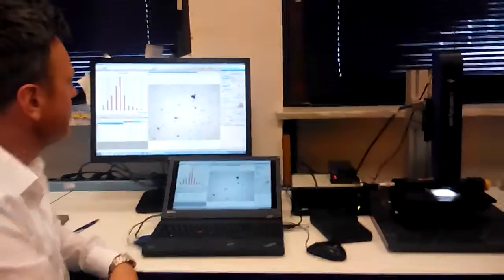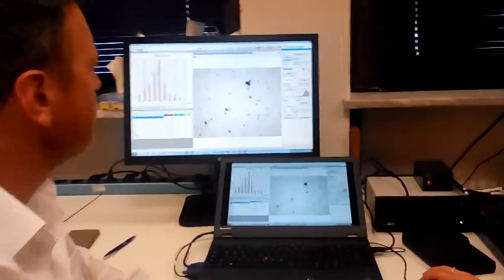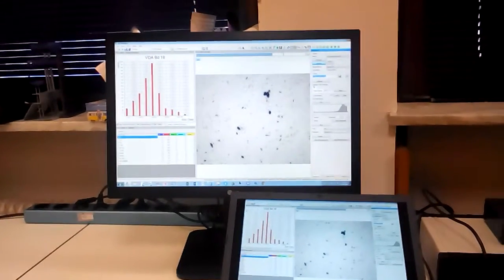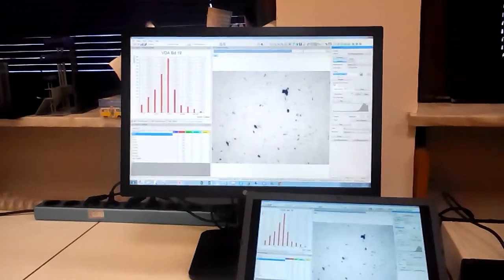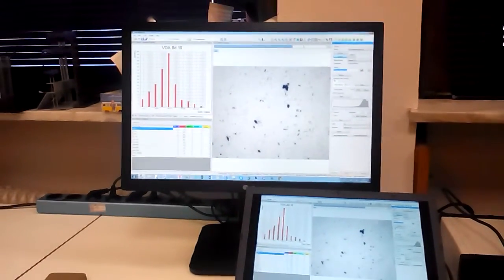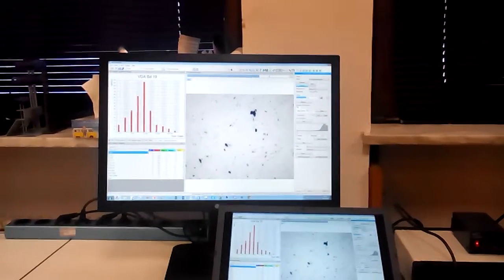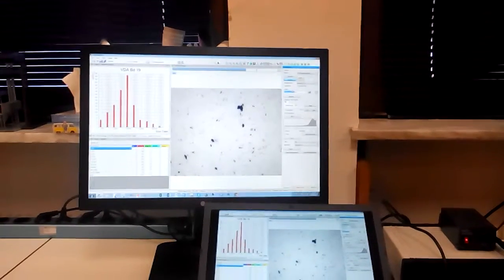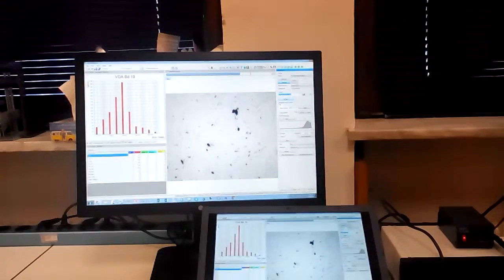So what's next? Next thing we have to do is choose a profile. That means we have to choose our measurement settings, how we would like to do the measurement. All this is saved in a profile. In our example, we would like to detect metals, and that's the reason why we are choosing a profile called 2-pass. It's a drop-down list, and we have the right profile.